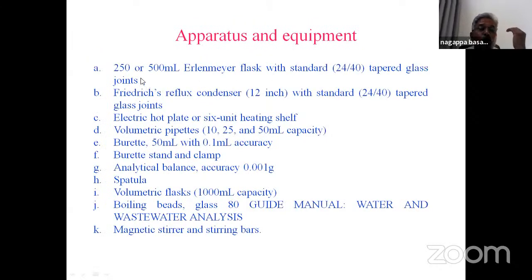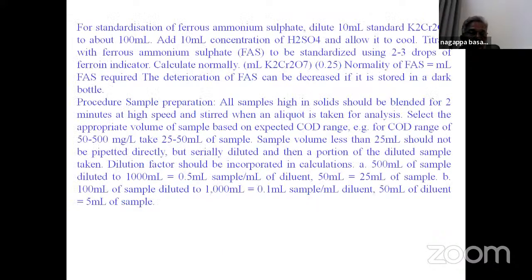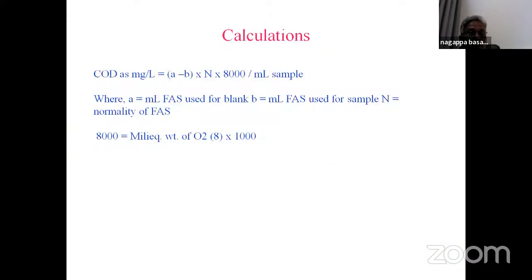The apparatus required: 250 ml conical flask, reflux condenser, COD digestion apparatus, volumetric pipettes, and burettes. I will come directly to the procedure.